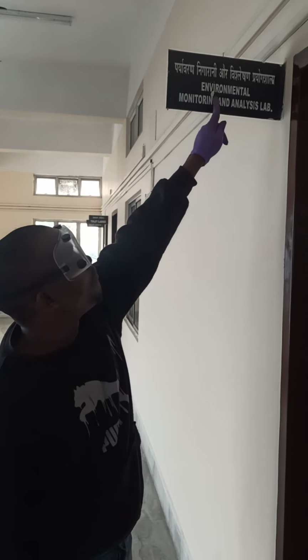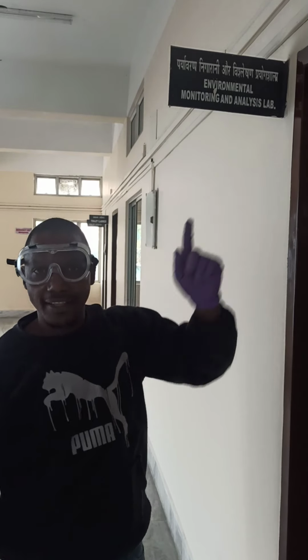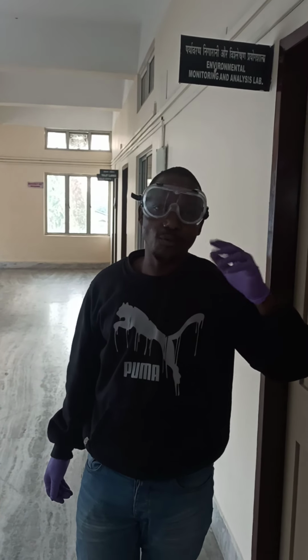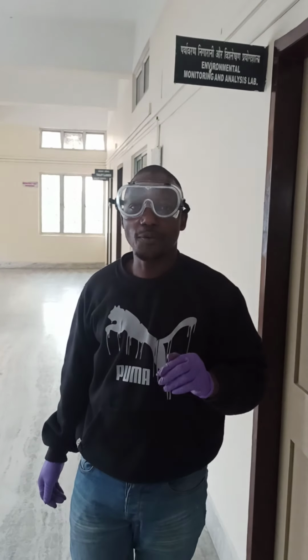This is environmental monitoring and analysis. This is one of my friends' labs. They are dealing with environmental monitoring and analysis of some parameters, the water, air pollution, and the related environmental components. But I'm going to take you into my labs, where I'll be enjoying some of the analytical-related instruments that I'm having. For sure, my lab is good.